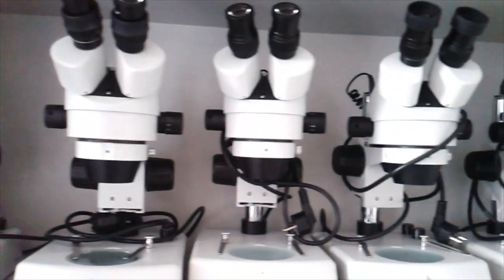If you watch a few YouTube videos or read some instruction manuals, it's relatively easy to start using the microscope. As a matter of fact, many people already know how to use a microscope because they've used microscopes in school.